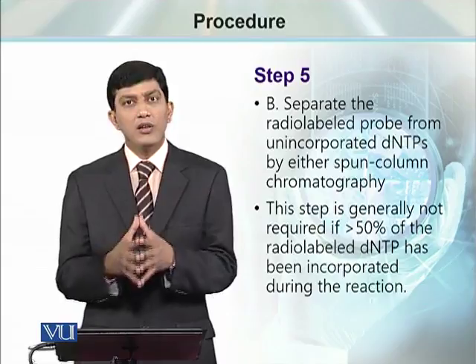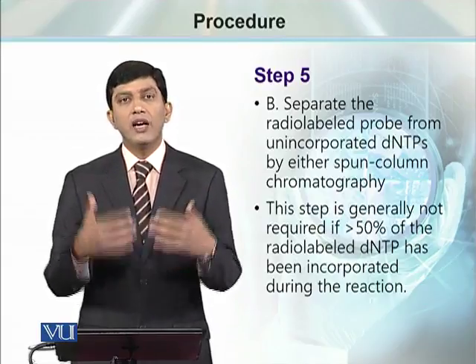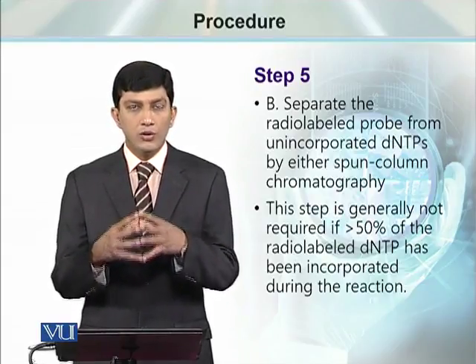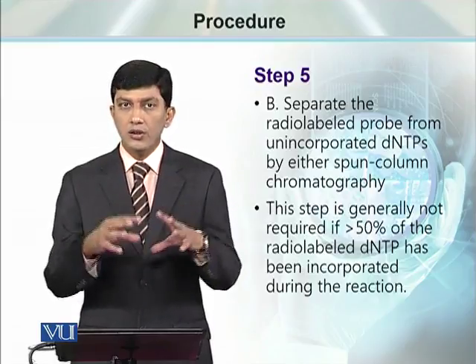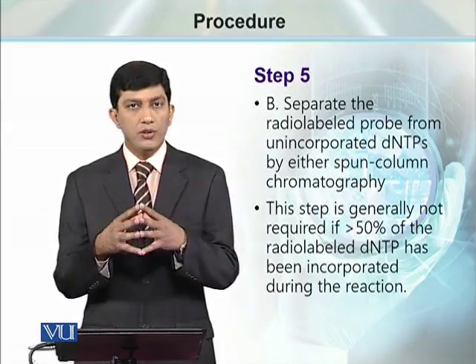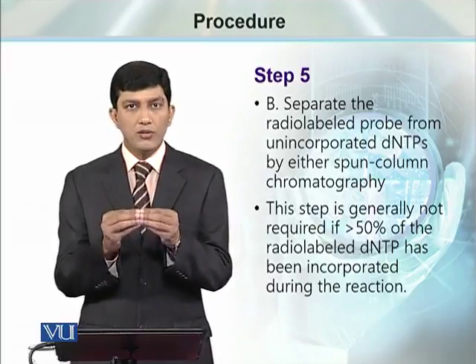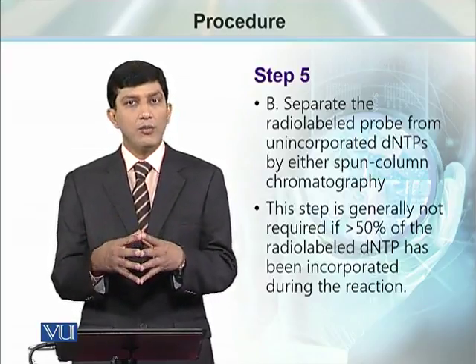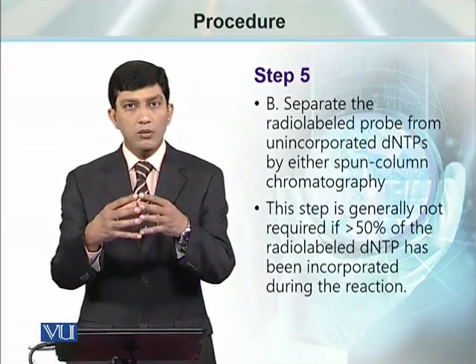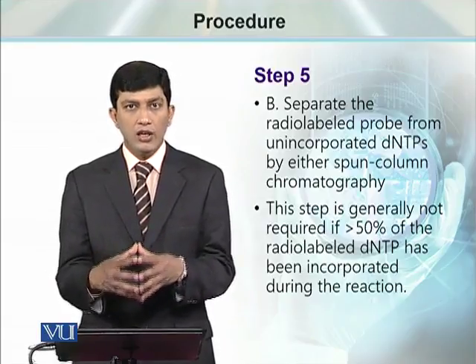When we are working with radioactivity, we need to be very careful and we have to work behind the protective shields. We cannot handle the radioactive nucleotide or radioactive probe openly in the lab on the working bench. For preparation of the probe, there are defined areas where you can work with radioactivity, where there are available thick shields in between you and the working area, and you work behind a shield using your hands.